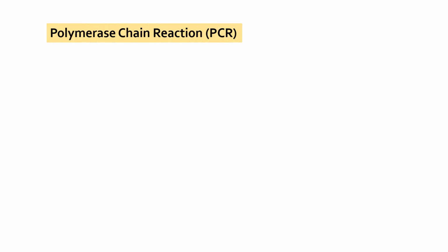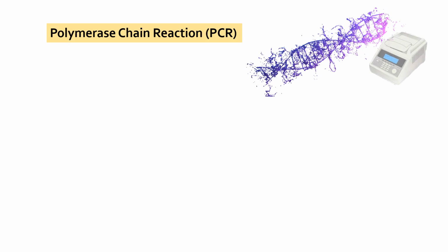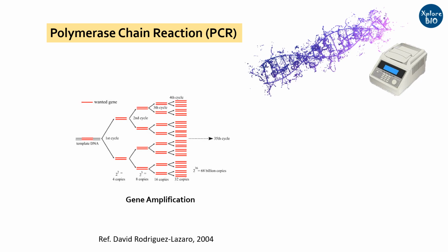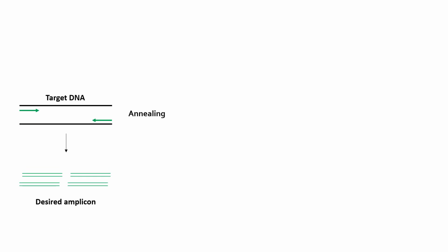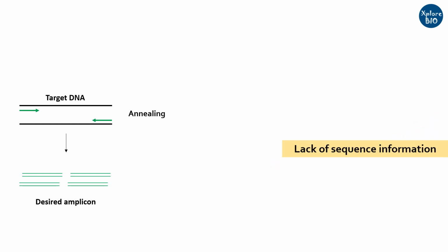PCR is one of the most routinely used methods in molecular biology to amplify the DNA of interest or gene cloning and many such applications. Generally, using complementary pairs, we get specific amplification. But sometimes we do not know the exact sequence of target DNA or gene to be amplified. Therefore, we use either the degenerate primers or partially complementary primer from other related species.